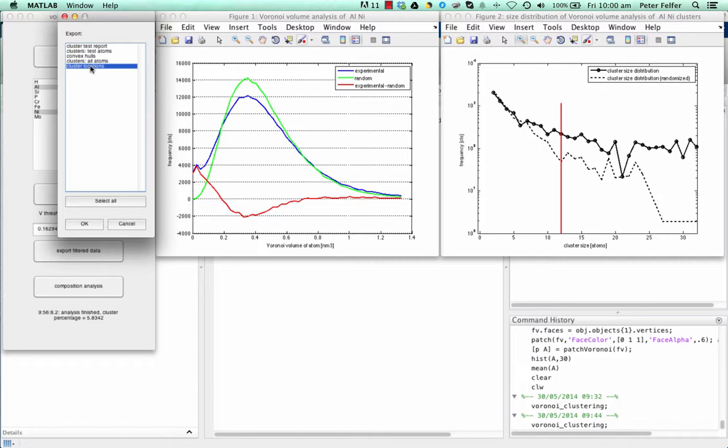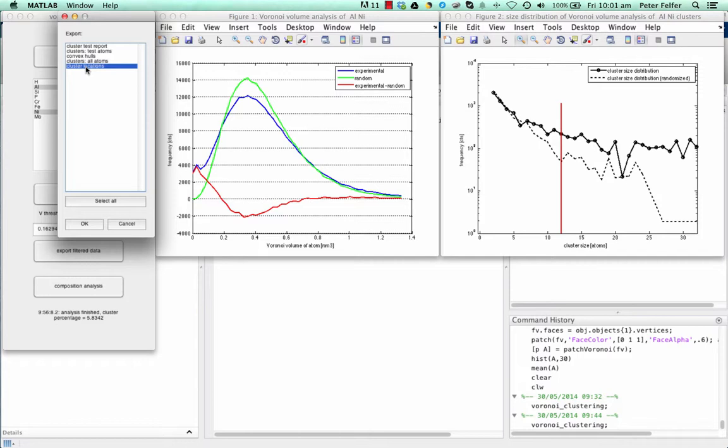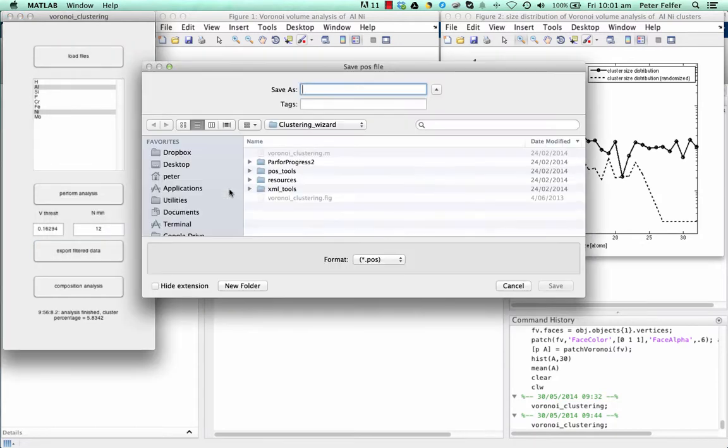As a last thing, you can export the cluster locations. What that means is that for each cluster, the centroid is calculated, and we export the positions of these cluster centroids. This gives you the opportunity to calculate statistics about the cluster distribution. It can also be used for reconstruction purposes. You can guide your reconstruction if you have a metal where you have small precipitates. Usually, the distribution of the precipitates is isotropic. So, you can have a look if the distribution of your clusters is isotropic. Or if they're further apart in X, Y, than in Z, then you know your reconstruction is incorrect. For now, we'll just go with the cluster test atoms. We'll export that.